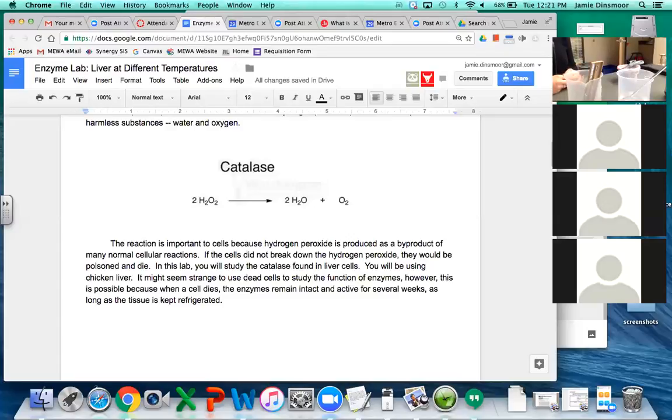We're using restaurant food warmers. This is safe, because that's what we have in the school, not a hot plate. So we're gonna roll with it. I just walked around for inspiration. I almost thought we could use the coffee pot and heat water in that, but this is better because it's real fire. And then we're going to be pouring our hydrogen peroxide.